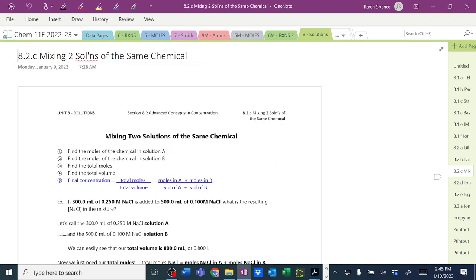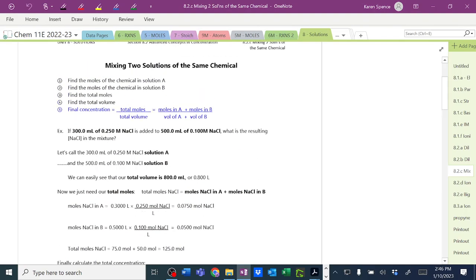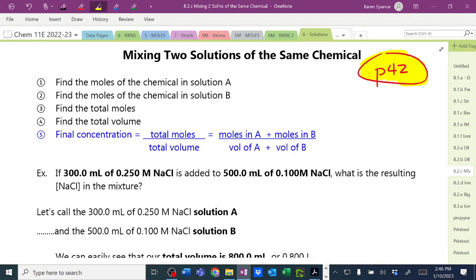All right, here we go. We are on page 42. You are going to be given a solution.